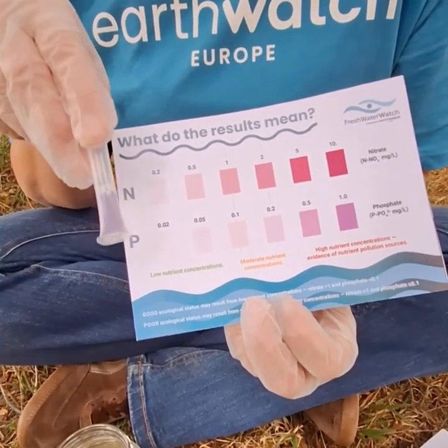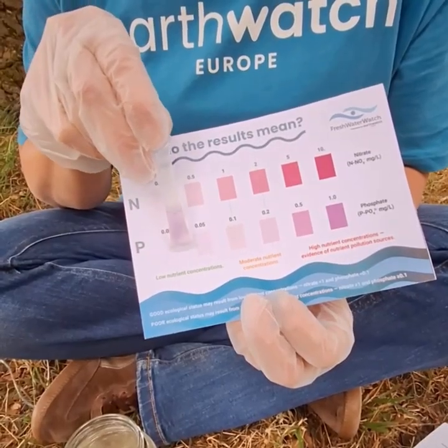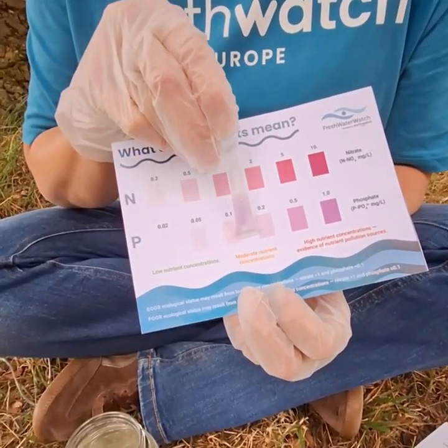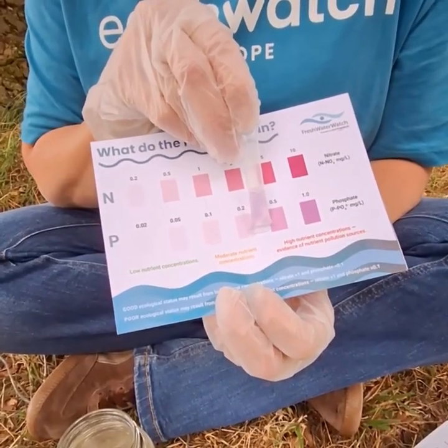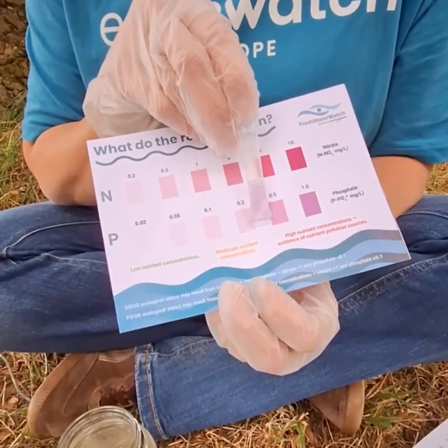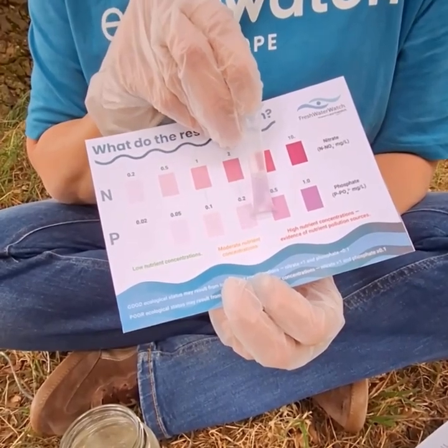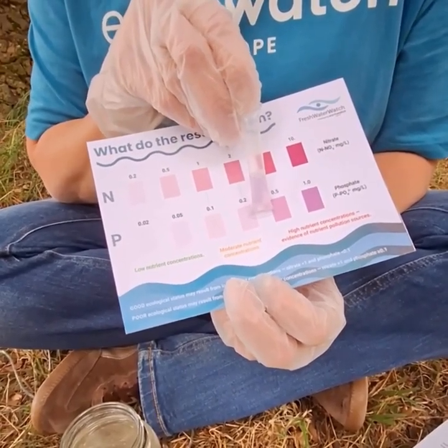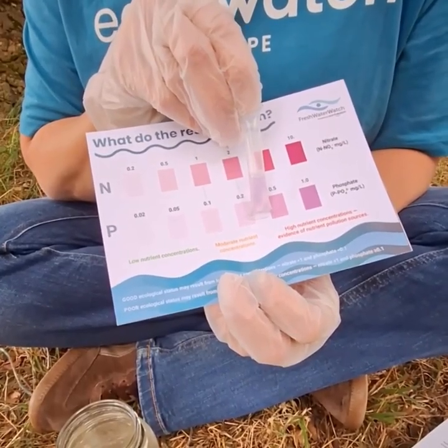After five minutes it's time for our phosphate result. We're going to take the tube and run it up the colour chart until one colour bar is lighter on one side and darker on the other side. We are not looking for an exact colour match — we are looking to land in between two colour bars. For instance, this would be 0.2 to 0.5.